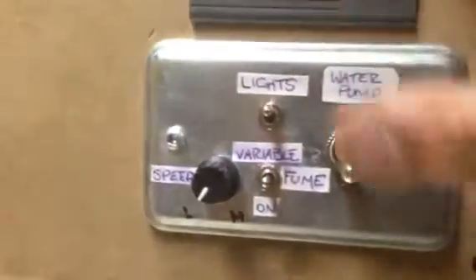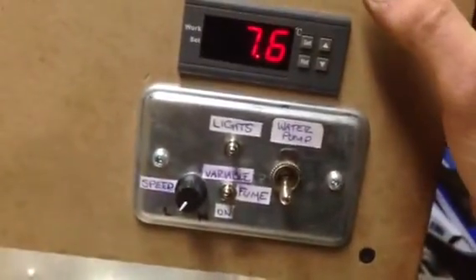Lights is obviously lights, pump is obviously pump. A little demonstration here: we'll start with variable, low speed. If I come up to the fan here, you can see it's stirred up. It's really quiet on low speed. It still does draw — the flaps out there open up. It's probably not doing anything with the front completely open like this. It's not finished yet, though.